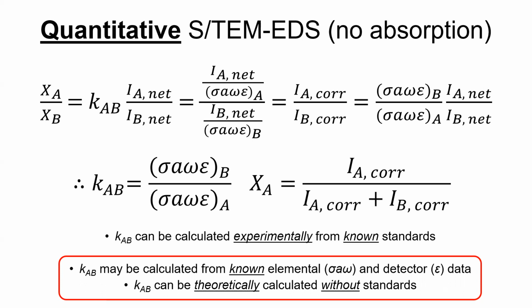So what we're going to talk about today is how to actually calculate the sensitivity factor from first principles using known data about the elements and known data about your EDS detector, okay? So that's what we're going to do today, we're going to go over how to do quantitative EDS from first principles without having any standards, okay?